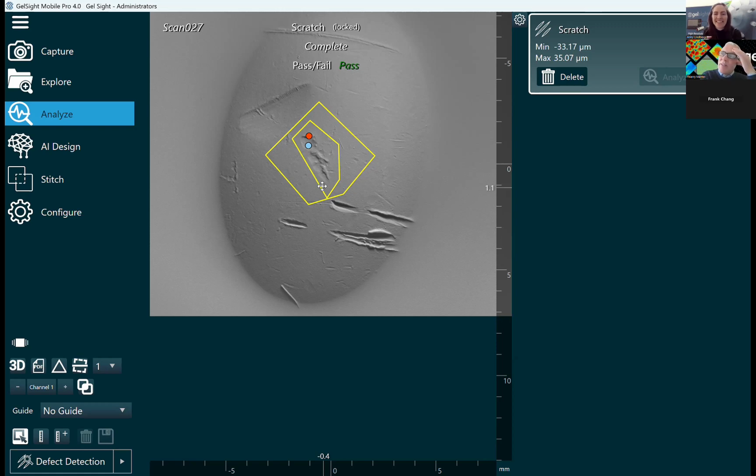Even with a Surface Pro 8, I have been able to do stitching using up to 12 frames, and of course, if you put them all together, you can easily measure a scratch of maybe 50 millimeters, 60 millimeters. This is typically something you can do. I think personally, the maximum I have done is about 48 millimeters on a very long scratch, but there is no reason that you cannot continue adding frames.